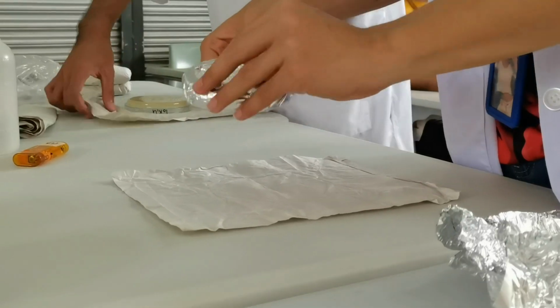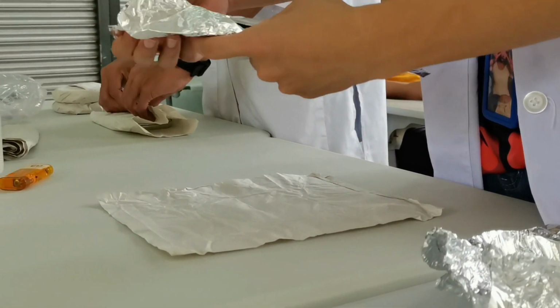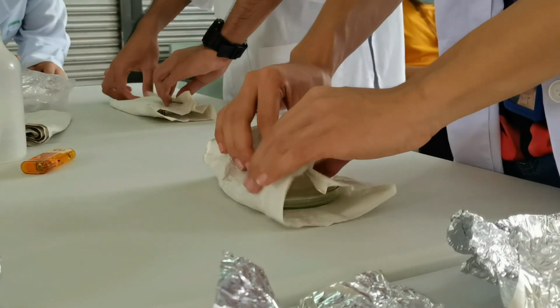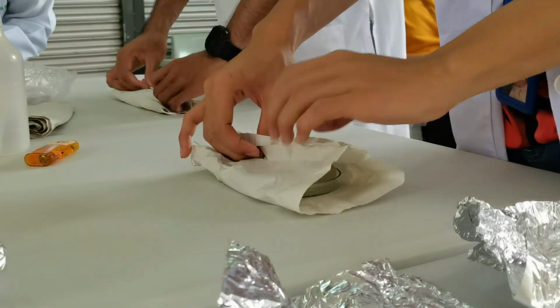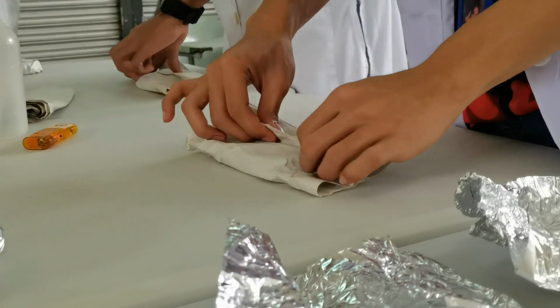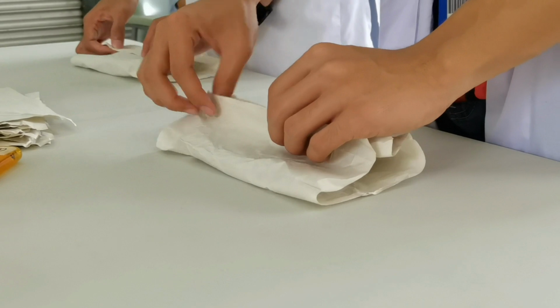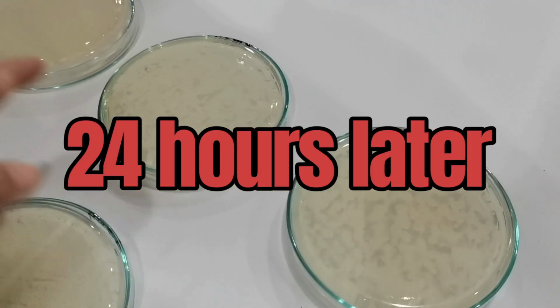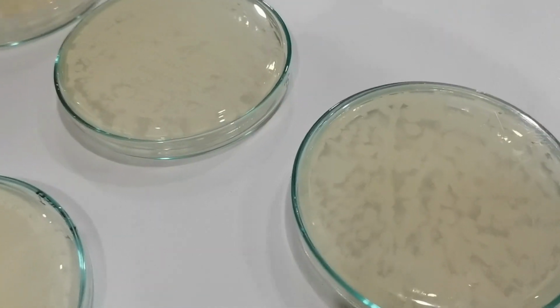After 2 hours of visible light exposure, all plates are rewrapped in these paper wrappers and placed in the incubator afterwards. So this is more obvious in the 300, no?